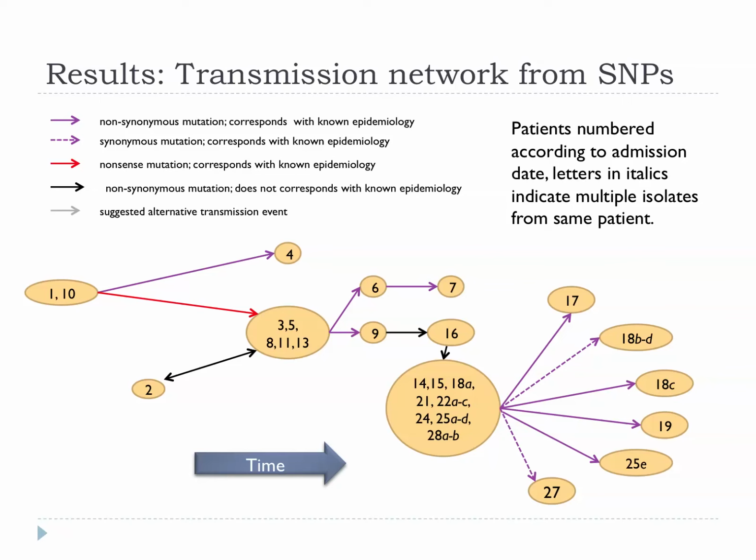One of the things that's interesting is that it's actually unclear what is the best way to display this kind of information, because there was a paper from Imperial College a couple of months ago showing that phylogenetic trees aren't the best way of doing it, because you have a mixture here of ancestor and descendant. When you draw a phylogenetic tree, you're assuming that everything at the bottom is descendants, and you don't know what the ancestors are. Anyway, we've got these transmission events going on.